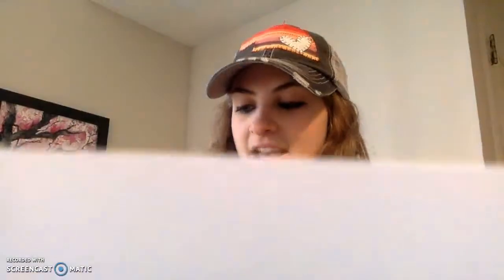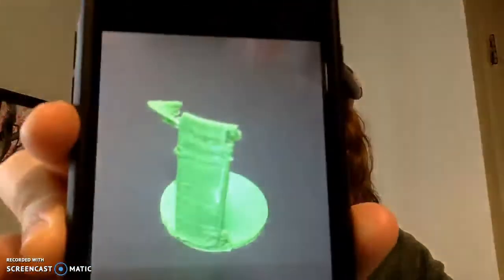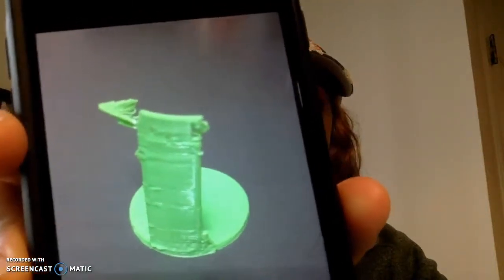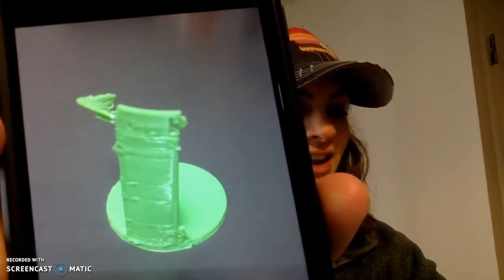I wanted to print the beaker — let me show you what it turned out like. As you can see, it's very incomplete. You can kind of see how it looks like a beaker, but obviously not the entire thing. So I was disappointed to say the least, but then happy that I had another week to maybe try printing it again.